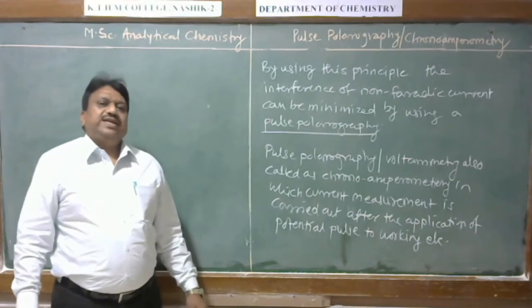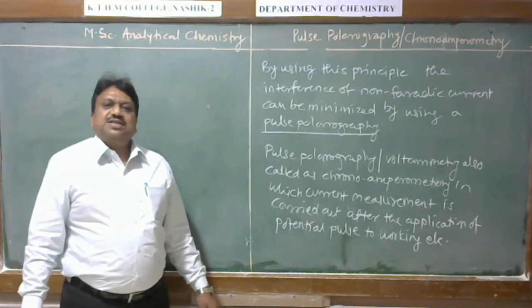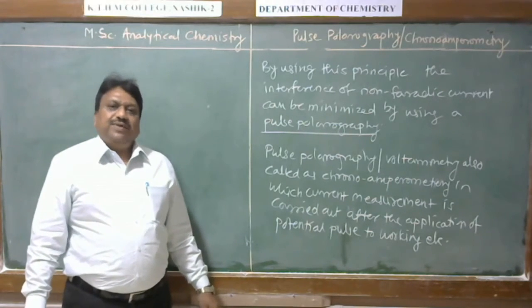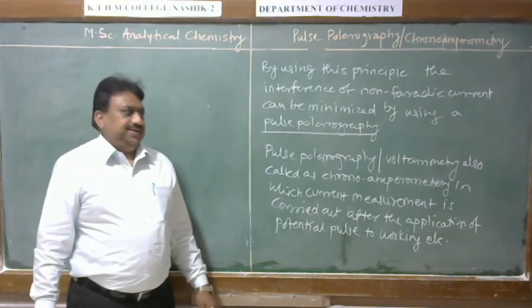First of all, we discuss how the potential pulse is applied to the working electrode and how the effect of non-faradic current decreases.